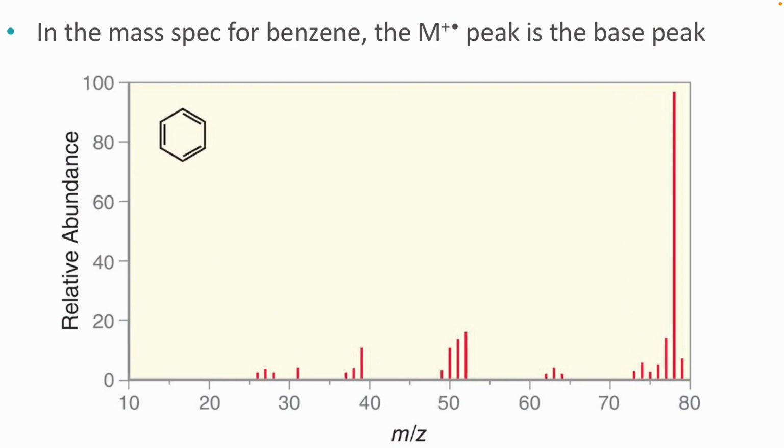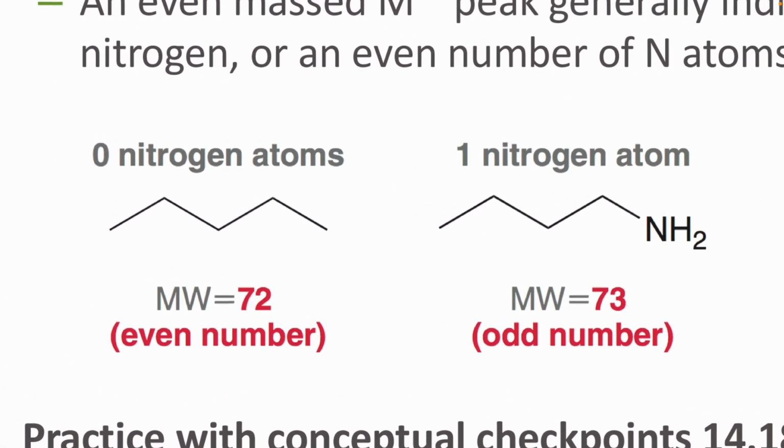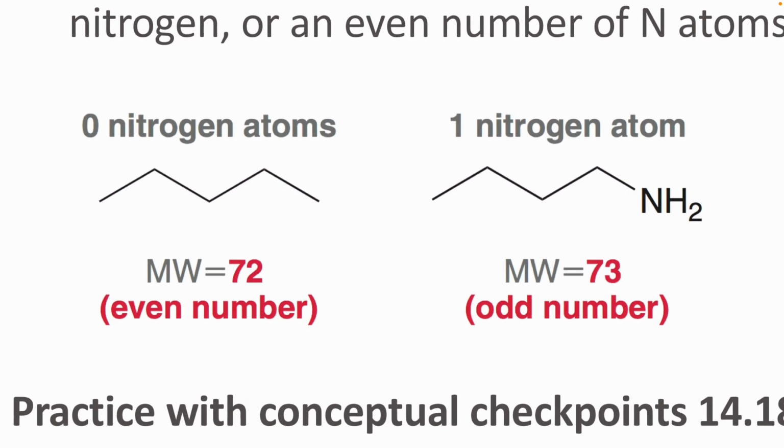So again, you can get your molecular formula, but it's like a lot. If all you have is a number, you're playing a pretty big guess and check game, right? So what other information can we get from that molecular ion? Well, first of all, let's just note the differences between values that we would get.